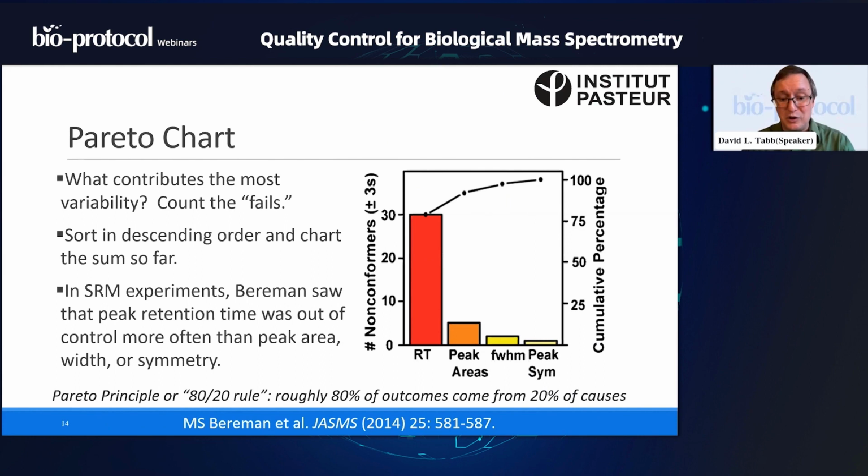There's another rule about this. When you're writing papers as a graduate student, writing the first 80% takes only 20% of the time. Sorry, this is a very unfortunate thing to hear sometimes, but it's often finishing the paper, doing the last 20% of it, that takes all the time. So the Pareto chart is kind of a take on that. In this case, we simply want to ask what contributes the most variability.